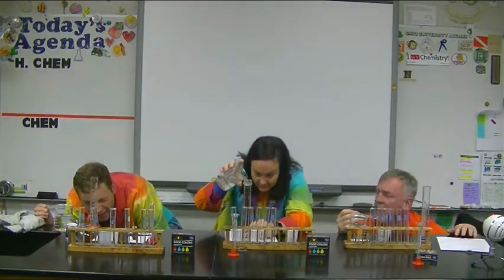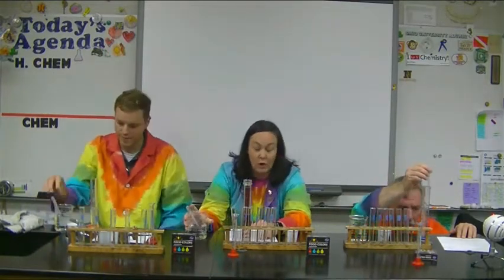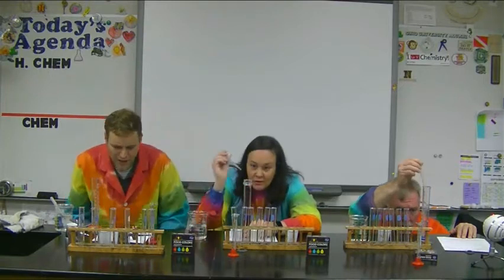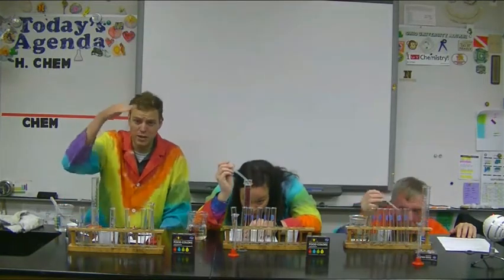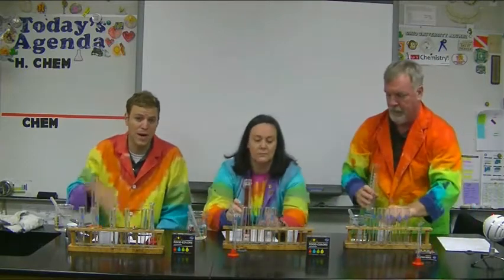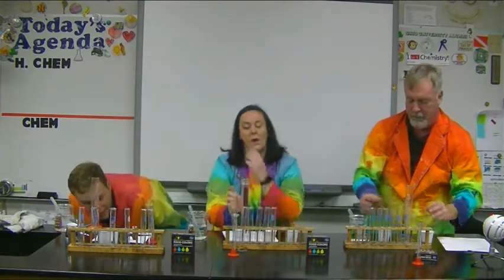Now, where should the meniscus go on these? The meniscus is the curve in the water when it's in a cylinder. Mr. Pilcher, where does it go? The bottom of the meniscus is where you should be reading from. So if we're trying to get 50 milliliters, we want the bottom of that meniscus to be lying right on top of that 50 milliliters line.